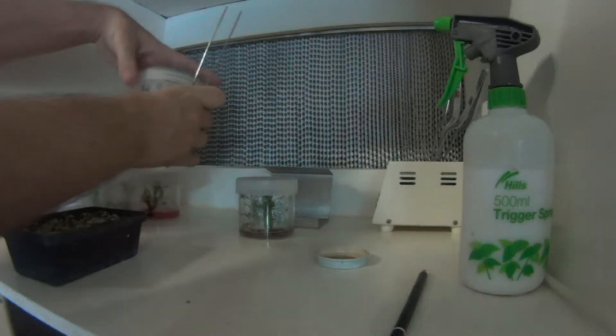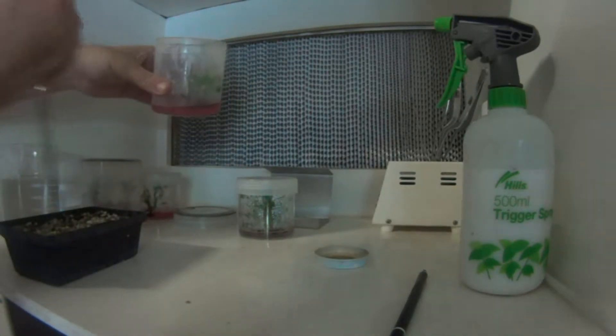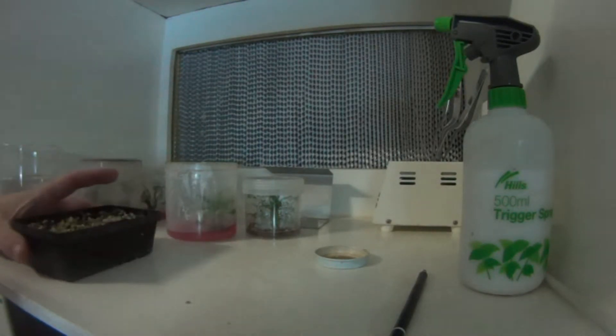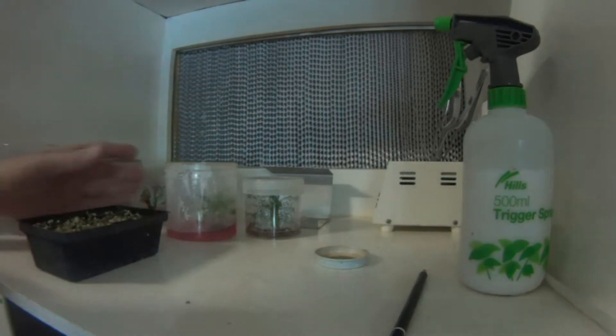It's pretty simple. No longer really require any sterile conditions. The media in here is perlite and sphagnum moss, as I did for the cuttings. This is not a bad mix. I sterilised it as well. There's various fungicides and stuff on the market that you can use.